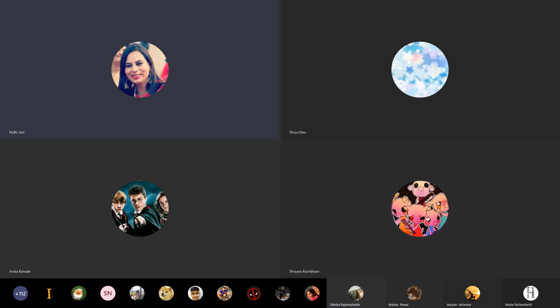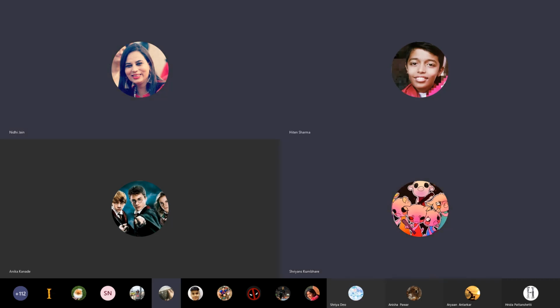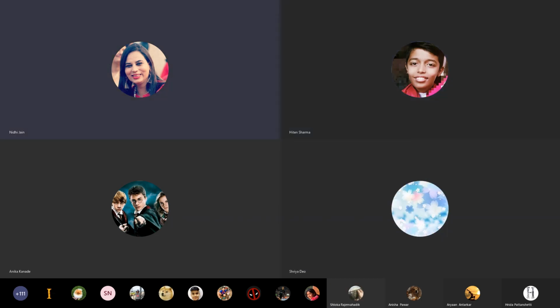Ma'am, is the elephant toothpaste flammable? No, it's not flammable, but it becomes very hot. Okay, thank you, ma'am. So let me complete the setup and then I'll start the video.